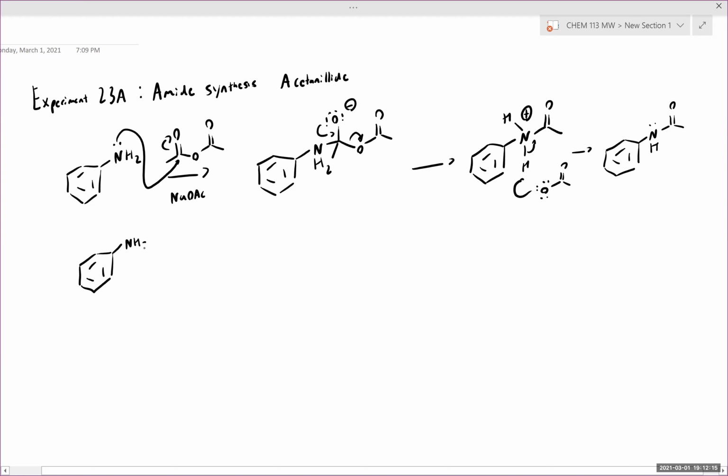One thing that I would like you to note for your percent yield calculations is we use an excess of acetic anhydride, both because acetic anhydride slowly hydrolyzes over time during storage and to minimize losses due to side reactions with water. We've seen acetanilide before, and if you have your old Chem 112 reports, you would be able to find your tabulated physical properties for acetanilide in your old report tables.